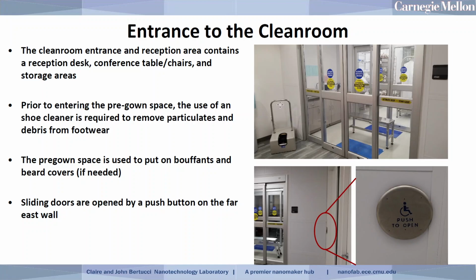And basically to use it, you simply push on the silver bar, which starts the bristles and the vacuum, and you stick each foot one at a time in this space, which will remove bulk particulates and debris from your footwear.